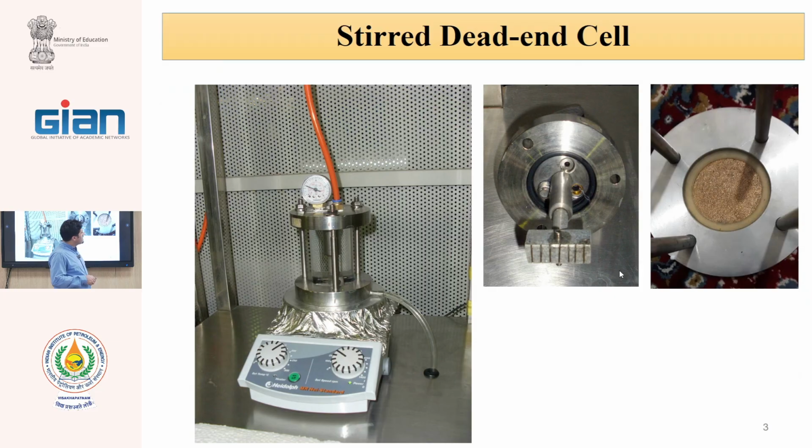Next we put this tubular section, which here is from Plexiglas, a plastic, but for high pressure we can use a metallic, stainless steel one. We put this section on top of this, and these tubes go from these ports, and we close them, and we have this.